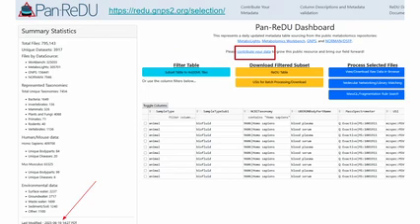At the moment, Zenodo is not one of the places that we directly support. We are working on that, though. So that will be one of the things that we hope to also index at some point. At the moment, what we index is just these repositories that you see here, which is Workbench, Metabolights, GNPS, and Norman. Those are the ones we have indexed up to now. Zenodo, some things work already with it, but most things don't yet. But it's something we are hoping to also achieve.